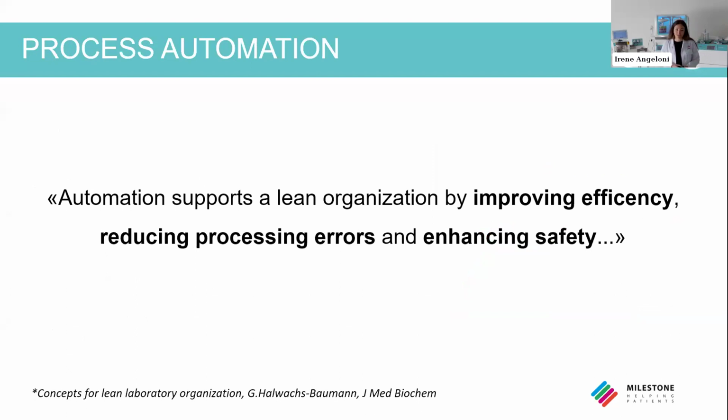So regarding the quality, I have an appropriate schedule for these different and fragile kinds of samples. The other topic, after the lean workflow, in sample processing management is automation. This aspect is important, especially if we relate it to the concept of the lean workflow that we have just seen.